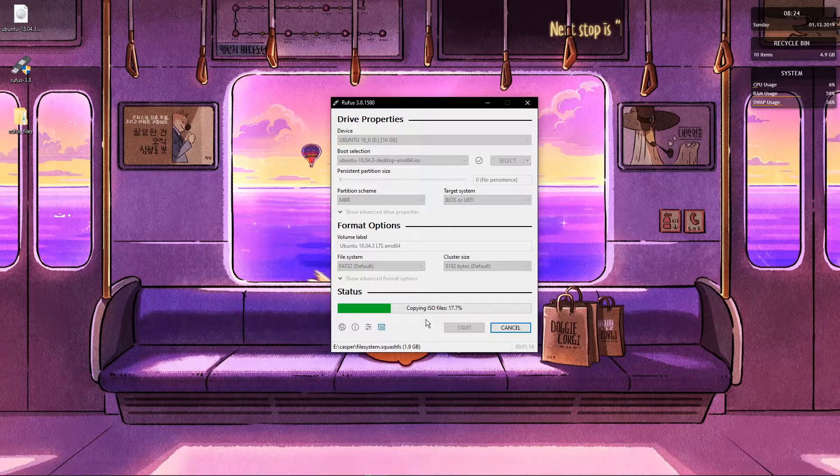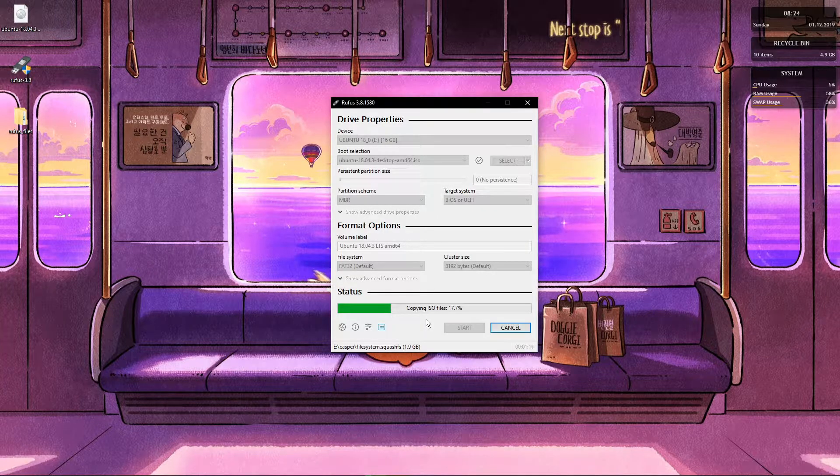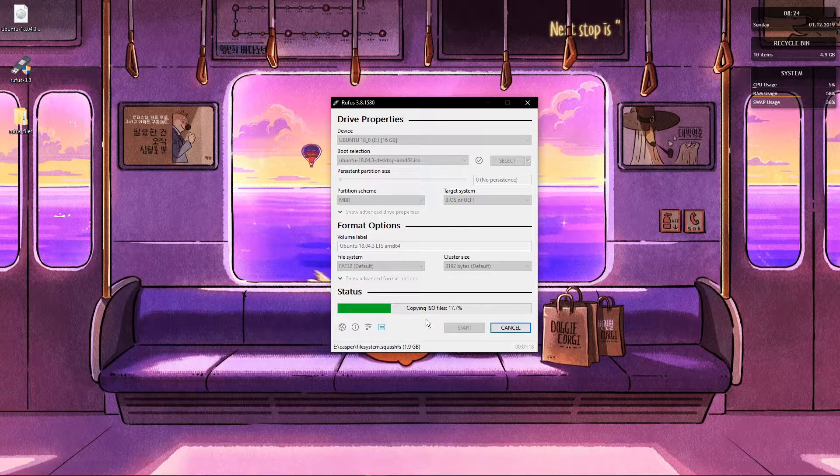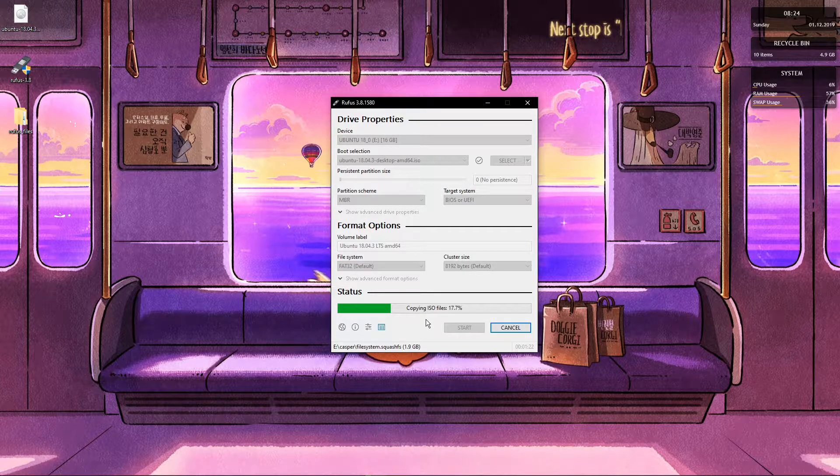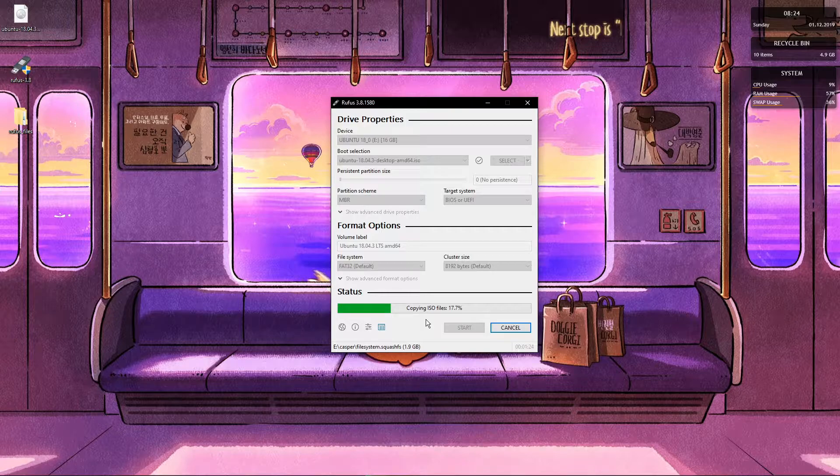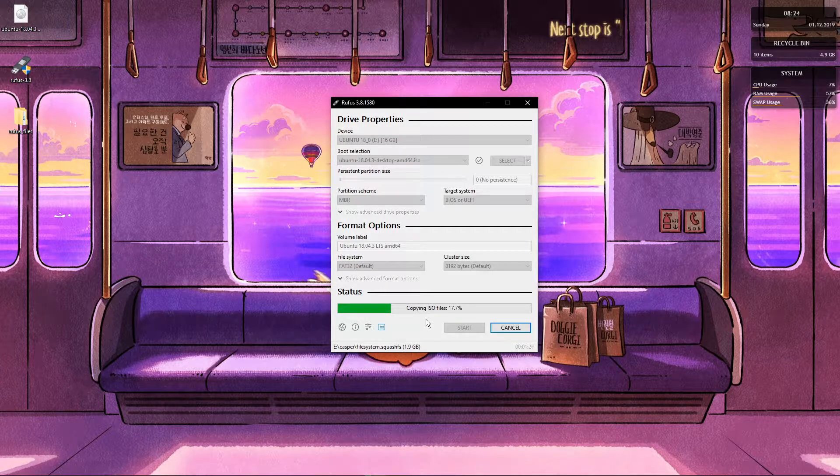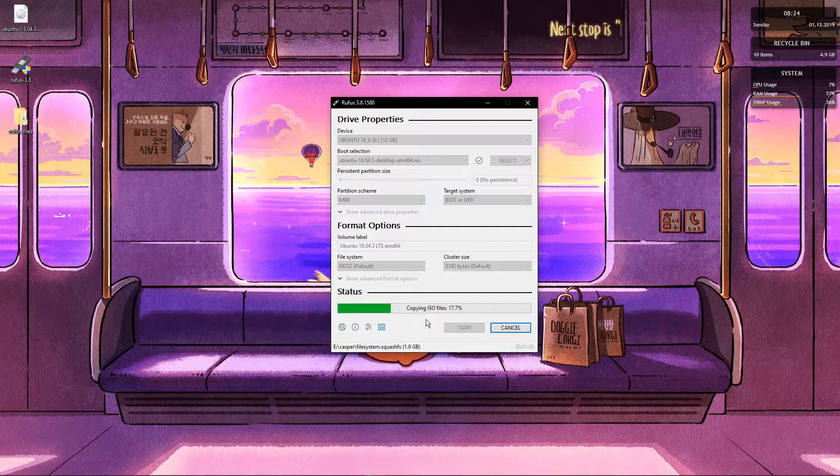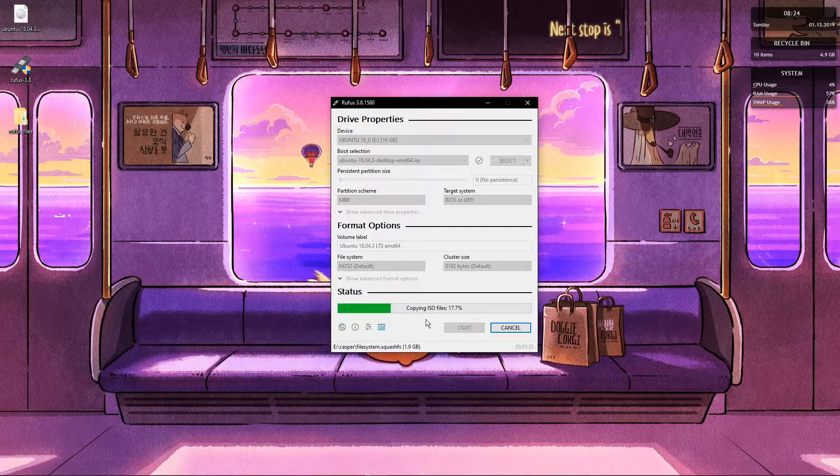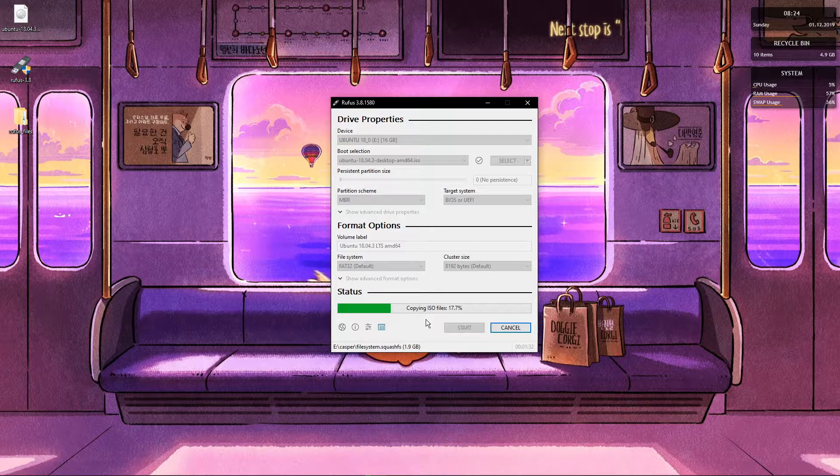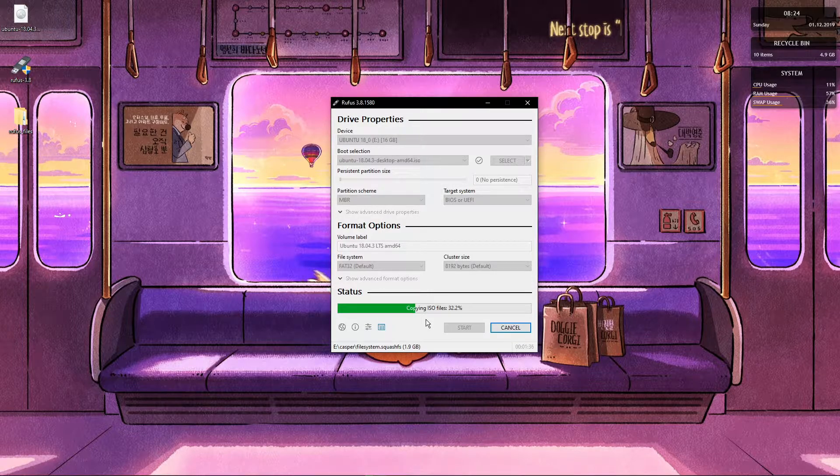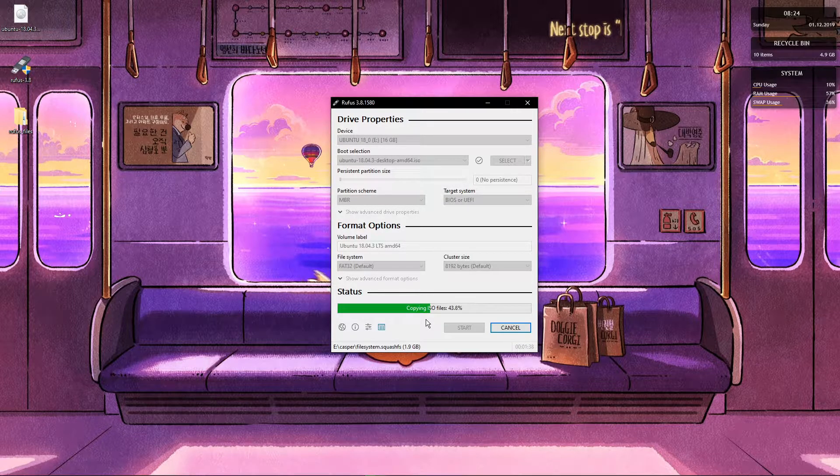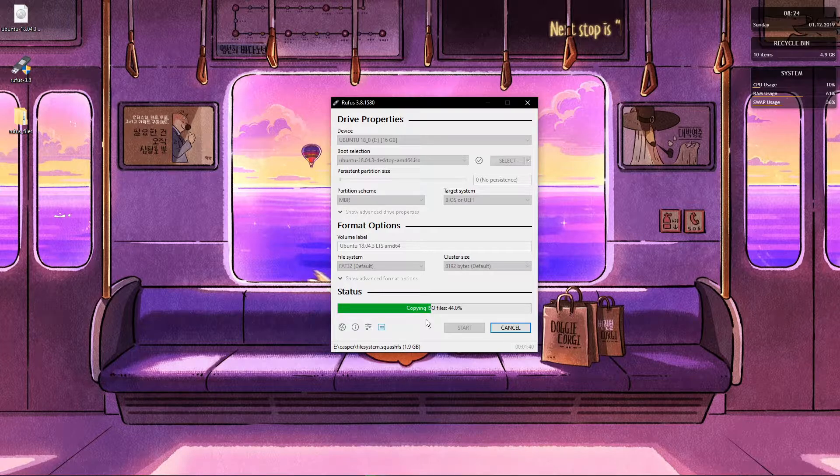You will access the BIOS menu and you will want to choose the options with your arrow keys. Select the option to launch the software that is on your USB drive. Once you do that you should be launching into the Ubuntu installer software.